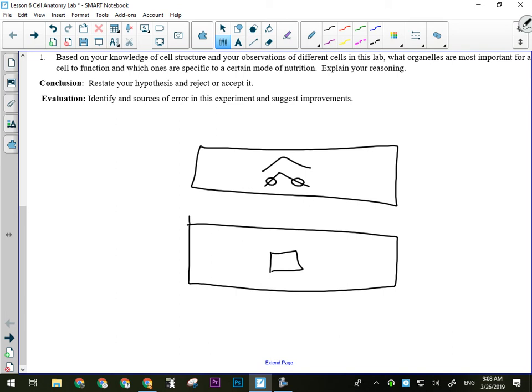Toothpick works really good. Okay, so in order to make this wet mount, you're going to do like a CSI thing. You're going to take the cotton swab and swab the inside of your mouth. Give it a good wipe, and you're going to be twisting the Q-tip between your fingers as you go, so you get a good smear on there. Then you're going to do exactly the same thing onto the microscope slide. Just smear it real good, again spinning the Q-tip as you go. All right, and you'll see some goo on there. That's your goo. Then you'll put a drop of water on there and make a wet mount just like you did with the letter E.